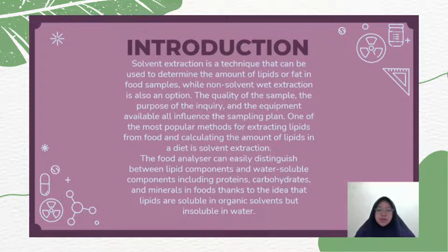One of the most popular methods for extracting lipid from food and calculating the amount of lipid in a diet uses solvent extraction. The food analyzer can easily distinguish between lipid components and water-soluble components, including protein, carbohydrates, and minerals in a food, thanks to the idea that lipids are soluble in organic solvents but insoluble in water.